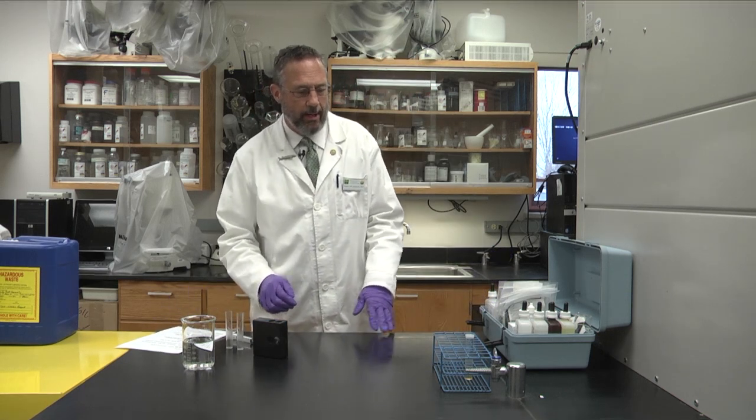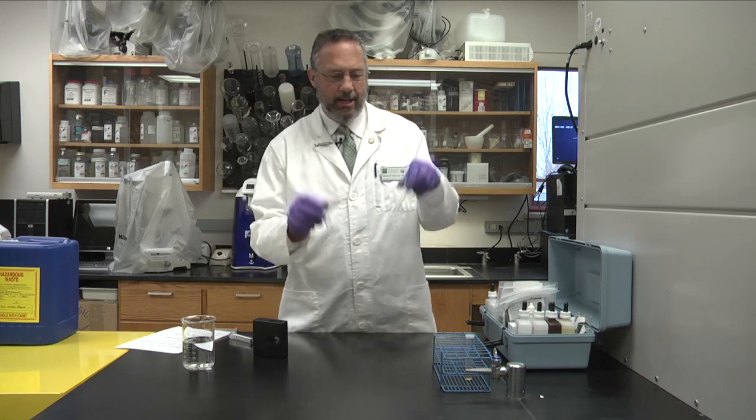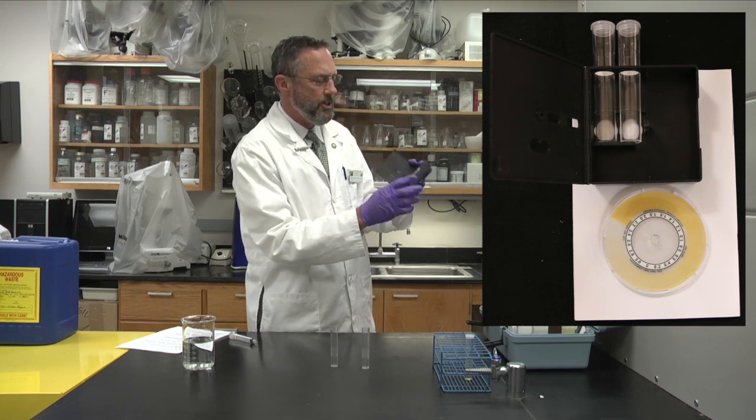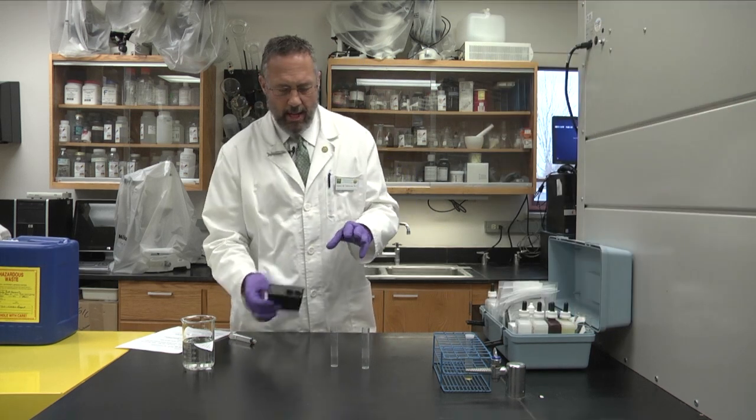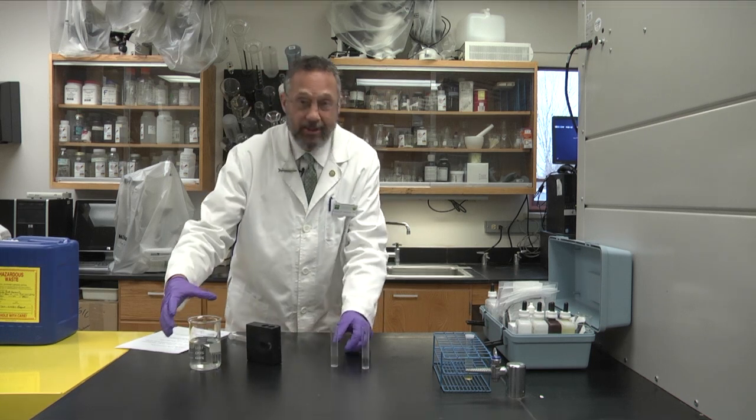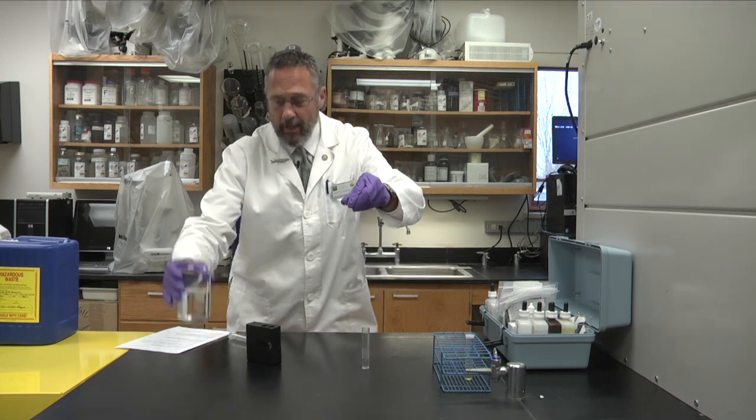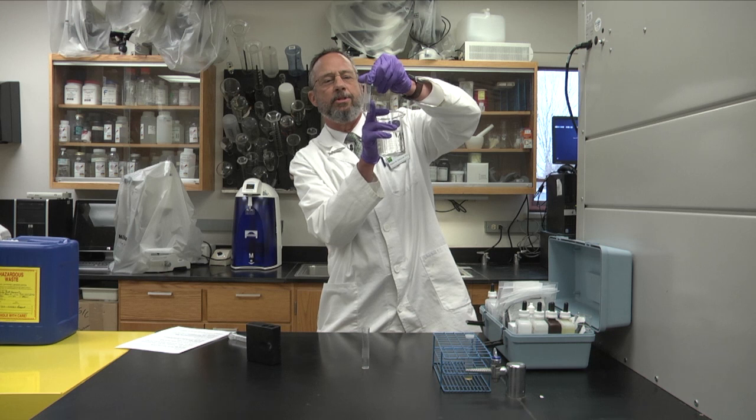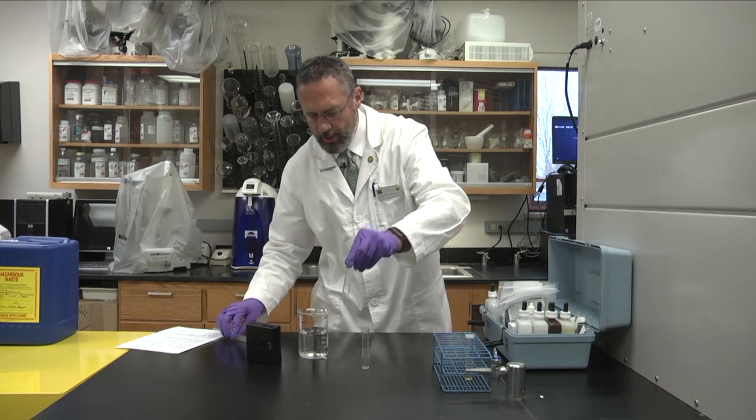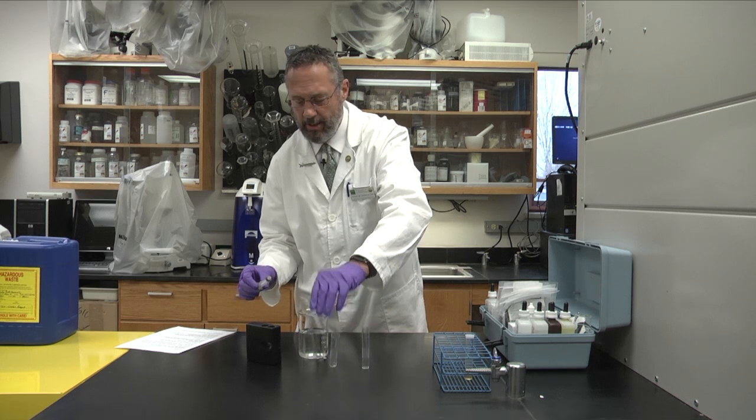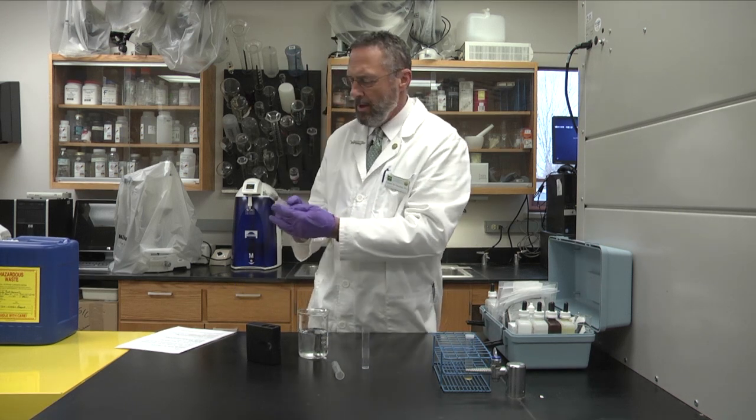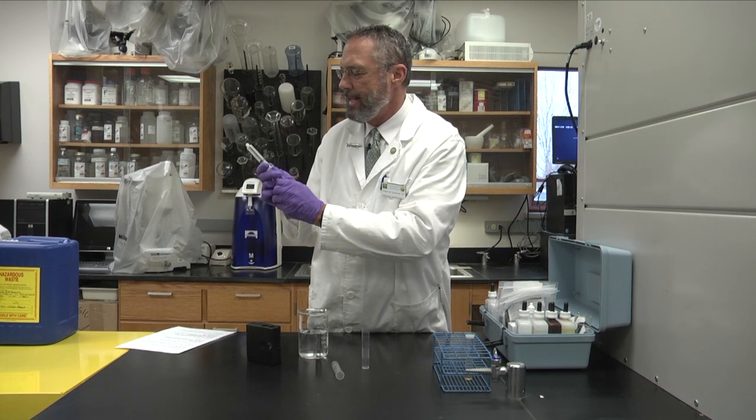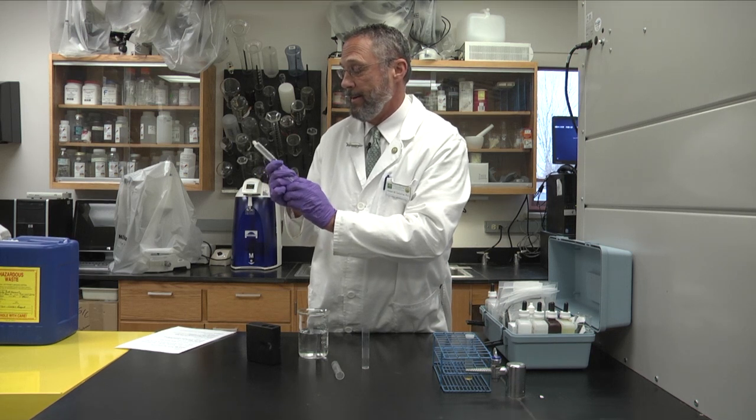To test for ammonia, we use these test tubes that come with the kit and we use this box here. It has an ammonia color wheel in the box and we use five cc's or five milliliters of the tank water. You can either fill it up to where the frosting starts in this tube or you can, I think it's a little bit easier actually, to use a syringe. So the syringe is marked off in the cc's or cubic centimeters. Ten cc's is the same thing as ten milliliters.